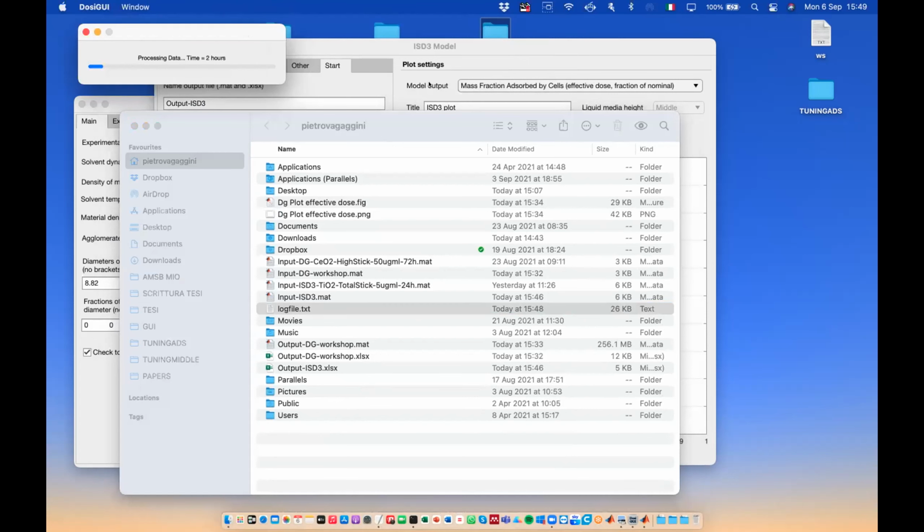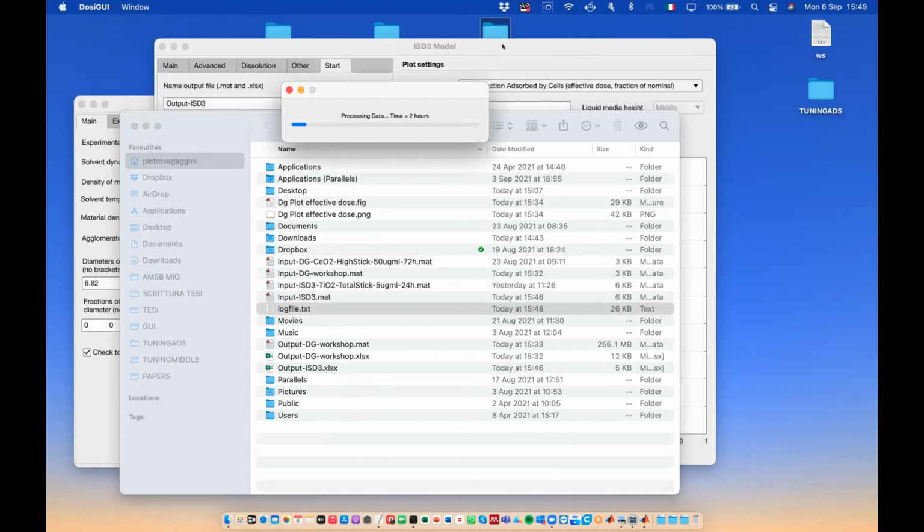Professor, I don't know if you want to go back to the presentation, and I can share my screen later, maybe, because the simulation is taking more time than I thought it would. Oh yeah, okay. So I'm stopping the sharing. So I've just got to figure out how to do this.